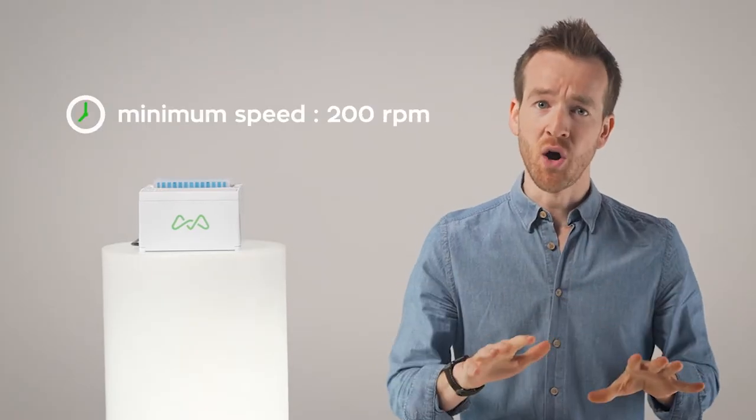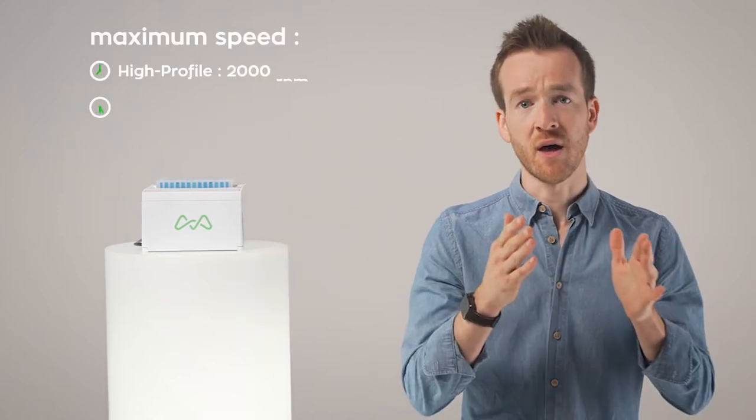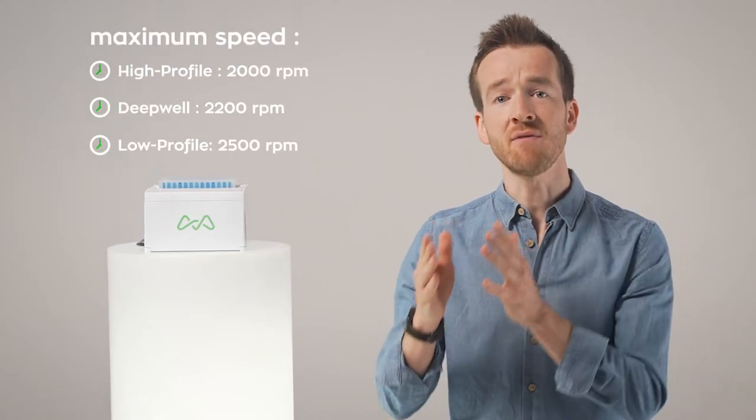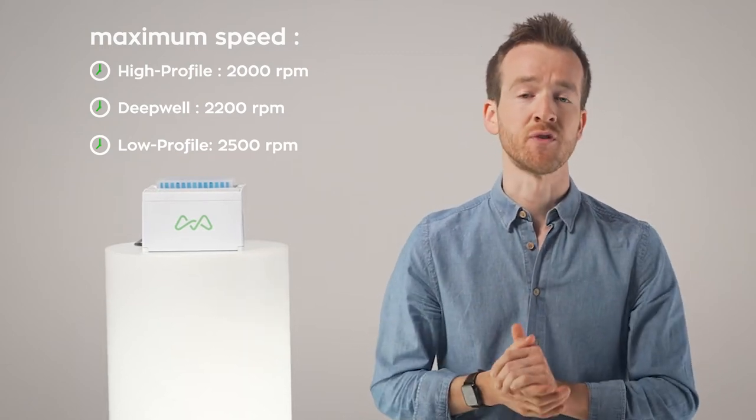There are different maximum speeds possible depending on the adapter used, so as to ensure ideal shaking conditions. With the minimum speed always being 200 rotations per minute, the maximum speeds are 2000, 2200 and 2500 rotations per minute for the high profile, deep well and low profile adapters respectively.